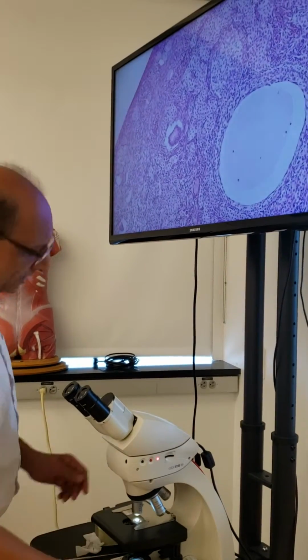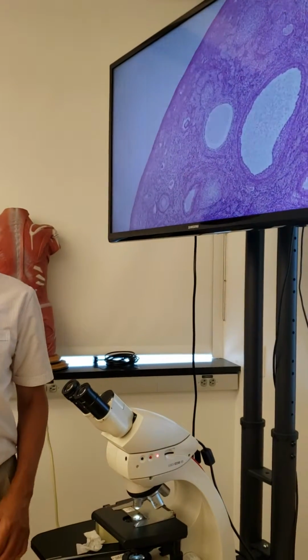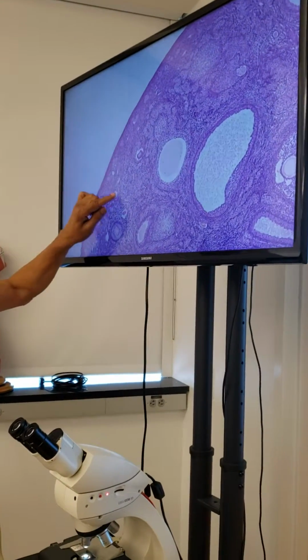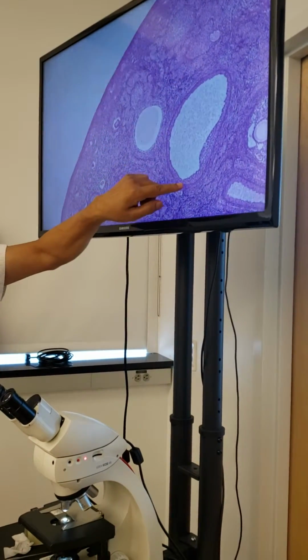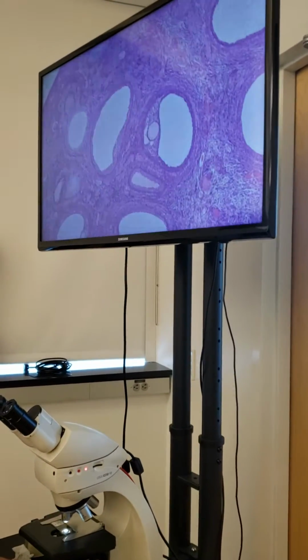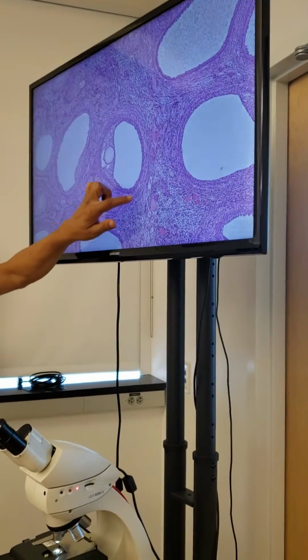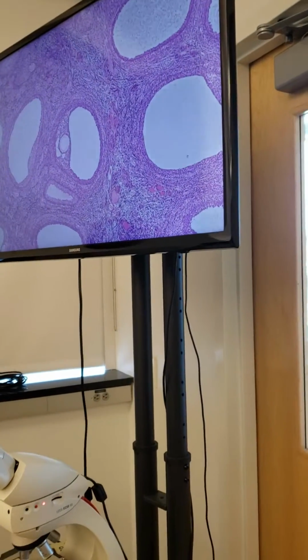We will study the details for the ovary in reproductive system. Today I am going to show you only the parts for endocrine. And notice there's tiny follicles here, circular things here. See small ones here, small one here, bigger one, and then big, and then big, and then more big, right? Let us say this big one here is one follicle, another follicle, and so on.